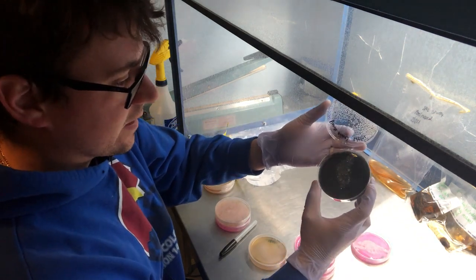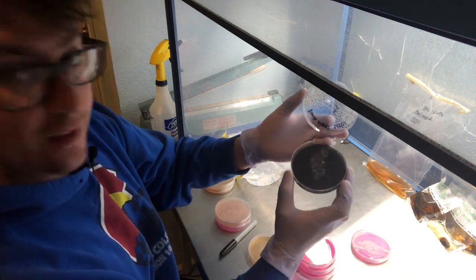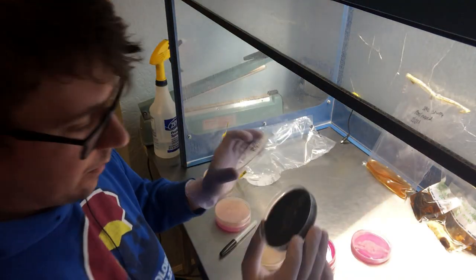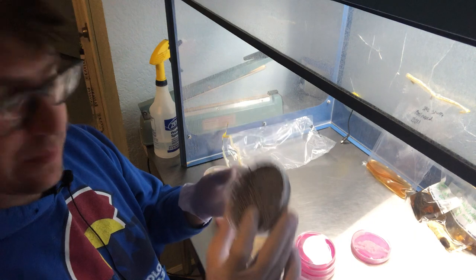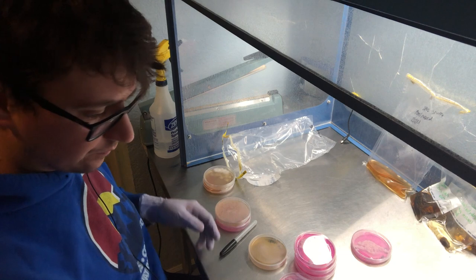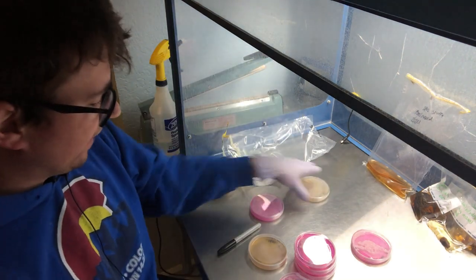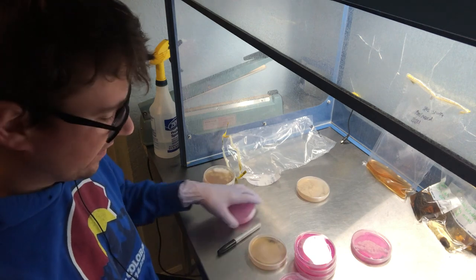Going on to my black charcoal yeast plate for this one - it is covered with bacteria. There might be one viable colony off to the side here, but I'm going to steer clear of this plate. This one is probably the worst. I'm going to isolate these four from the blonde morel - that looks pretty promising. This one doesn't have any growth yet so I'm going to set it off to the side.